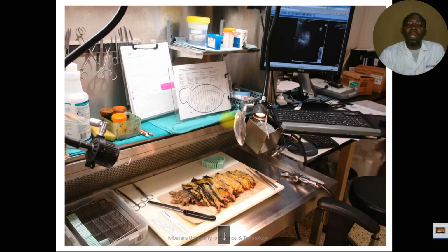We can look at another image and see different features. So here we have the source of light. These are light sources. We have light here where my cursor is, and then we have a light here. We have a lens here, and this can flash on the sample so that it provides enough light for us to identify specific points of interest on the tissue, so that we can easily identify which part of the tissue we are going to cut out and put in the cassette for further investigation.